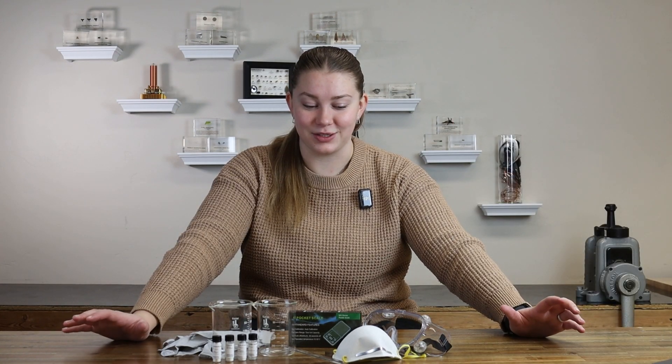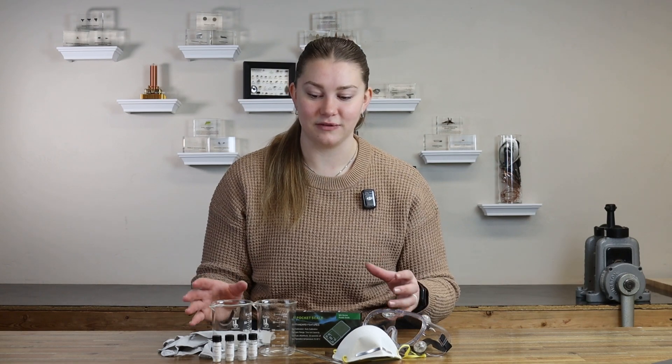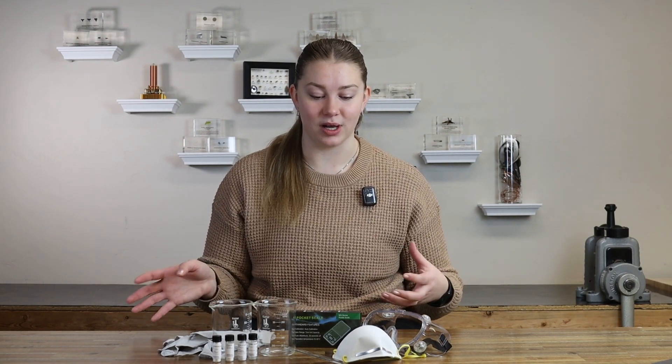This is honestly one of my favorite reactions because it is so mind-boggling. This is one of the coolest reactions we have, so I'm stoked that it's box one. We give you enough supplies to do it multiple times as well. So that's really exciting because if you screwed up the first time — like I definitely did — you get another chance. But that's what experimenting is all about.